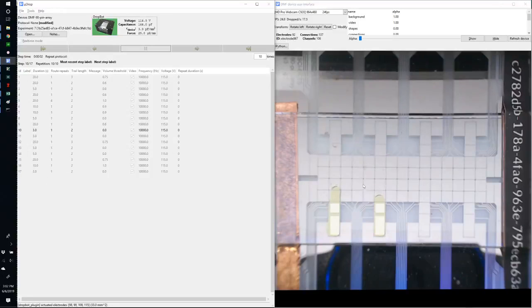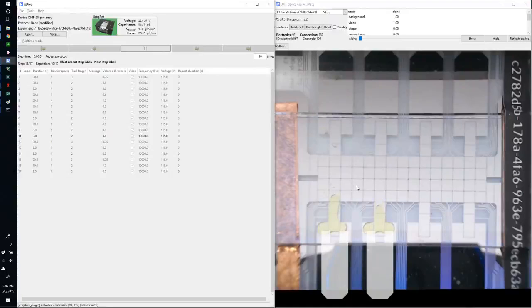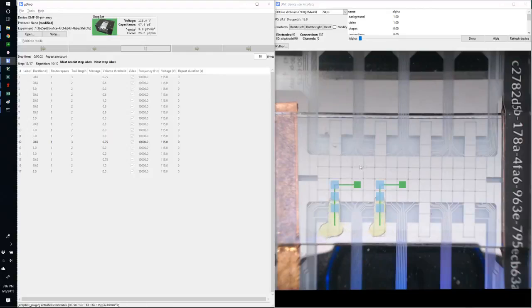Now, with our multi-sensing feedback IP, we can perform closed loop control on that split to ensure that regardless of the chip characteristics, you should get a much closer volume between the left and the right daughter droplets. I was able to repeat this. This is now the 10th repeat.